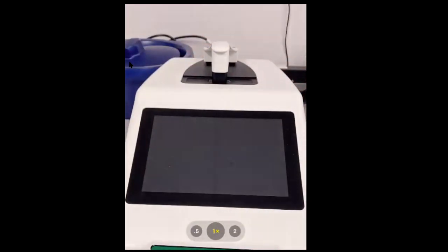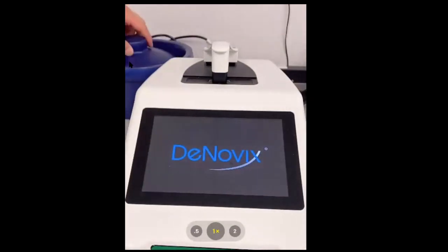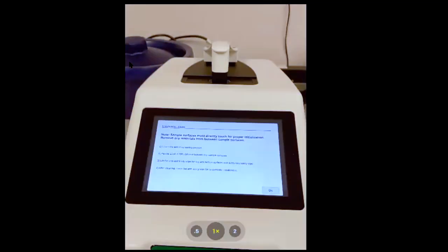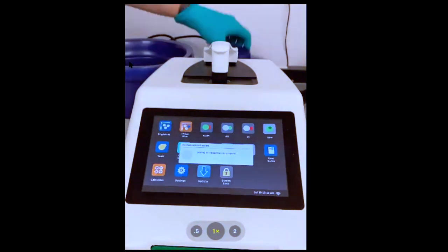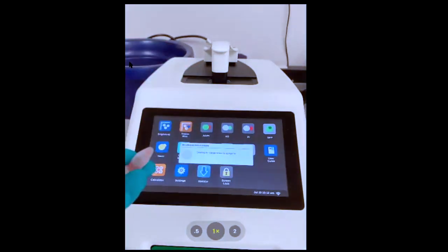Startup process, and then I have some Jurkat cells here that I can do some quick measurements with. So just going to make sure they're well mixed, as we just discussed here.